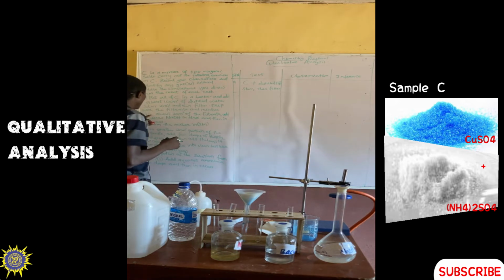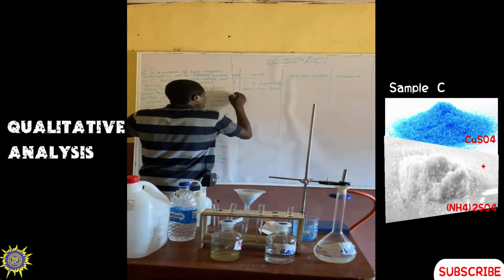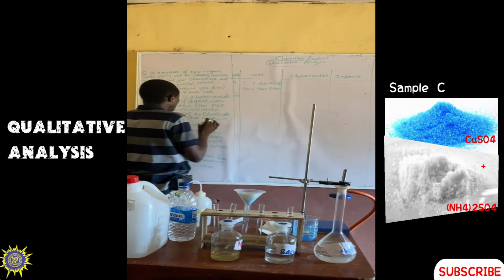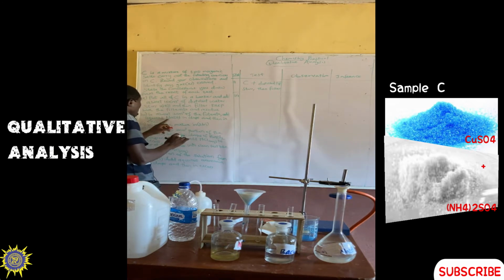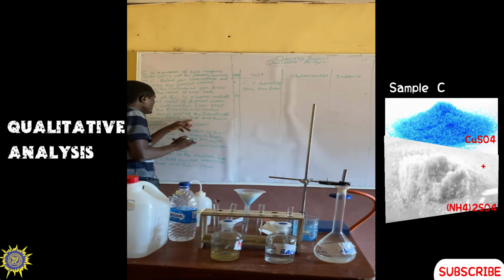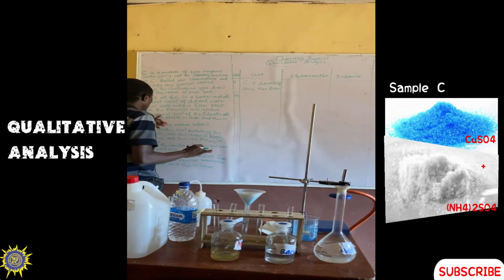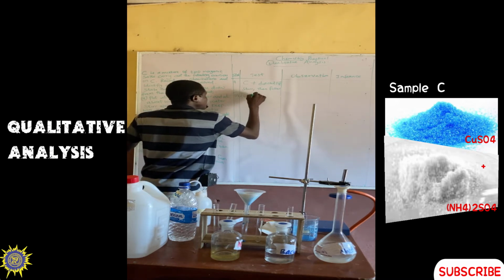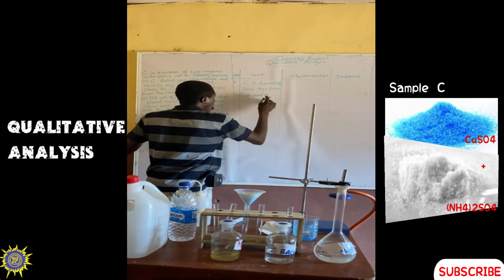Now, Roman figure 1: to about 2 cubic centimeters of the filtrate. So this filtrate, you take 2 cubic centimeters of the filtrate, add aqueous sodium hydroxide in drops and then in excess. So we have to add to the first 2 cubic centimeters of filtrate.